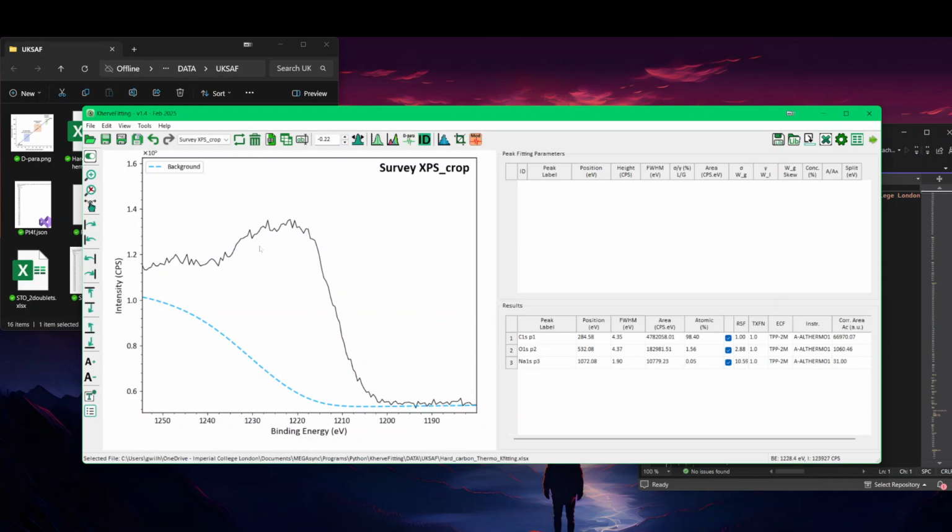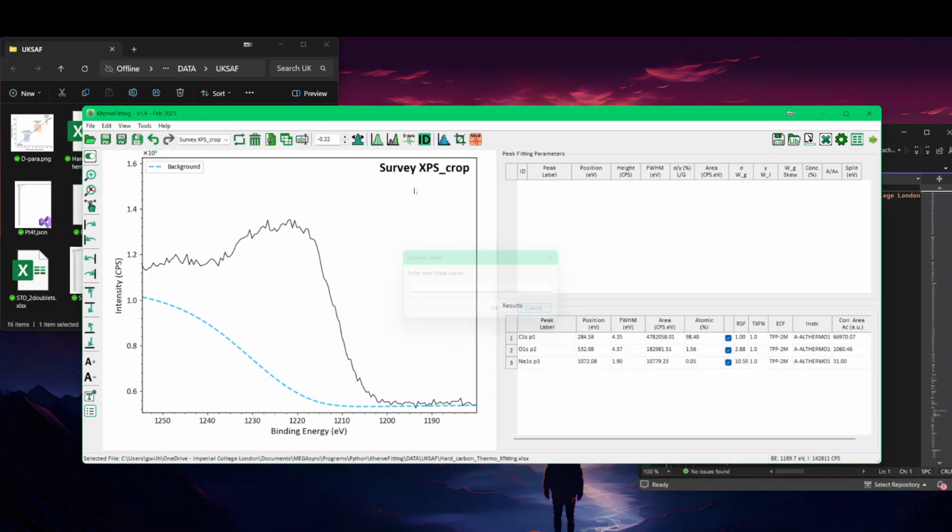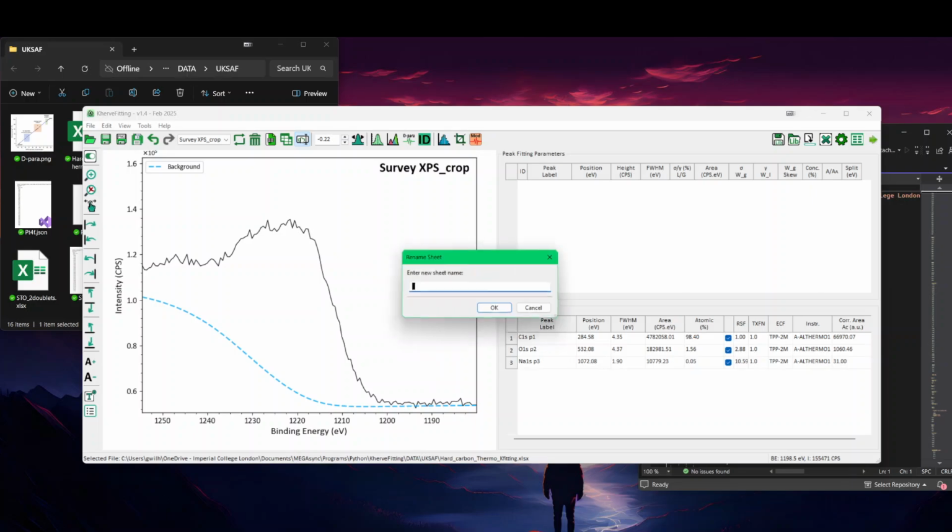Okay. You may want to change the name. Maybe we'll rename it to something close to CKLL. We already have the CKLL, so I'll call it something else. I'll call it C, let's say OG.